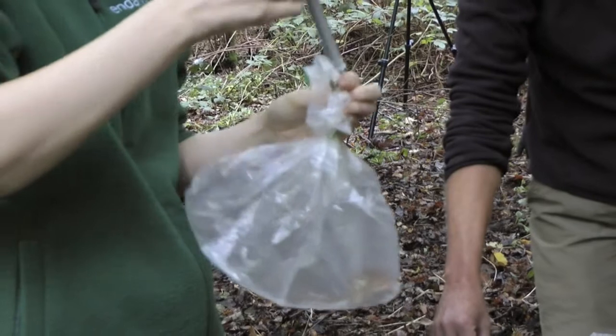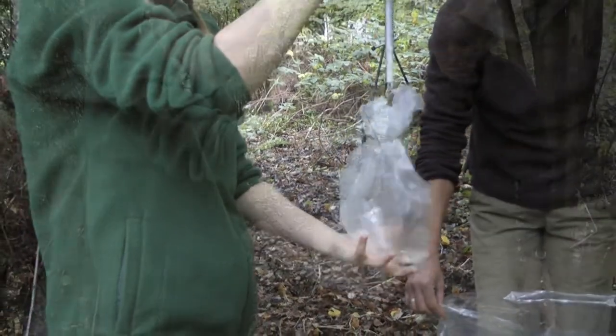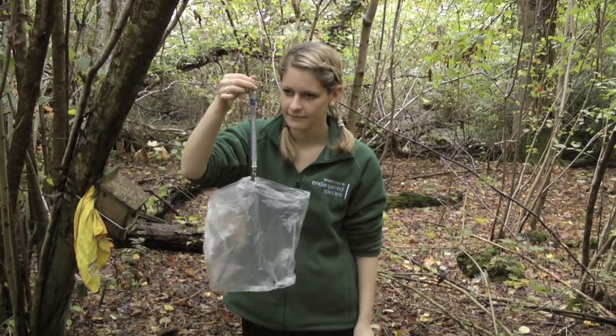Attach the scales and keep your hand underneath but not touching the bag in case it slips. This will give you the gross weight of the dormouse, the bag and the tag. Make sure that you note the weight of the bag and the tag so that you can record the net weight of the dormouse.